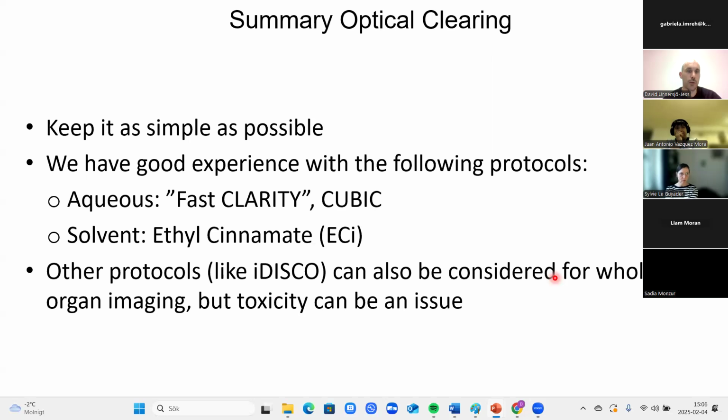If your antibody only works with fresh frozen, or say it only works with acetone fixation and it doesn't work with PFA fixation or paraffin or anything like this, it probably won't work. Okay. Thank you very much. Very, very interesting. Thank you.